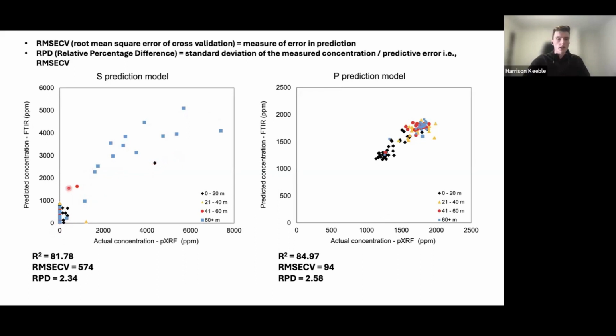There are a few up in the saprolite, but these again could be very limited examples of jarosite present throughout the regolith. Again, you can see that with the phosphorus pretty bunched up, meaning that we have very limited samples. And again, the concentrations are quite low compared to the iron and aluminium we saw on the other slide.